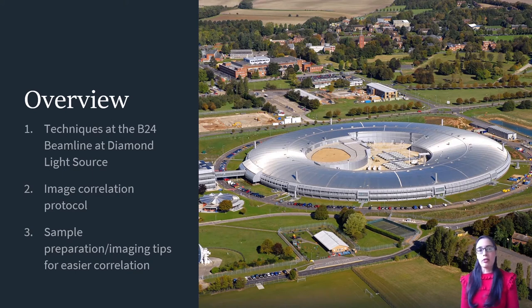I'll first give some background about the two imaging techniques and the workflow that's been developed for users here at the B24 Beamline. I'll then show the process that we use to correlate the images using open source software. We use eC-CLEM in Icy. And then I'll give some examples of the kind of research that's possible using these techniques. And finally, some tips on how to achieve successful correlation by optimizing the experimental process.